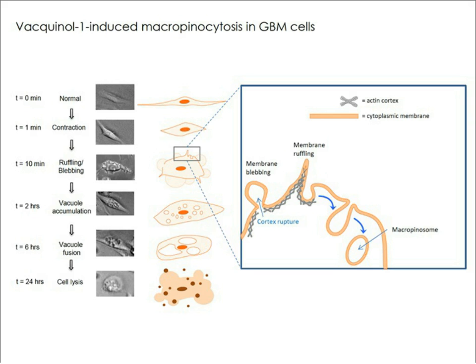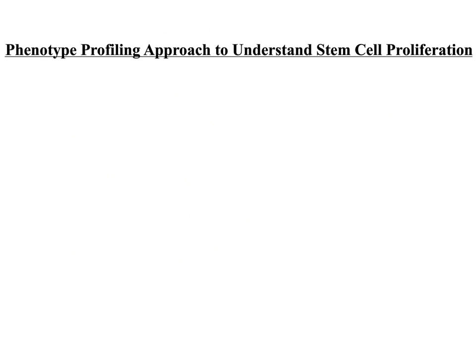The second exercise was on embryonic stem cells. So we wanted to use a similar phenotype-based profiling approach to identify some phenotype with which cells can be fine-tuned and their proliferation studied much better. So we used mouse embryonic stem cells as a platform here, and we performed the same image-based screening after addition of different compounds. And what we see here, we measured colony morphology.